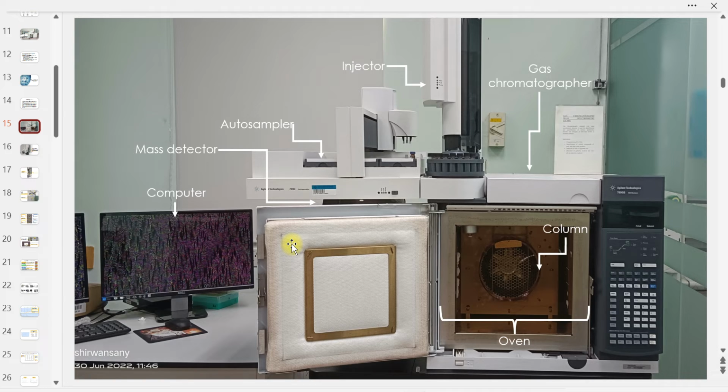Why is that? First, TOF ni they have a time of flight, dia ada macam satu length. Detector dia tu panjang. So if we want to maintain the vacuum, MS ni dia ada vacuum. So for us to maintain a vacuum for a lengthy tube, dia sangat susah sebab in Malaysia we are highly humid.